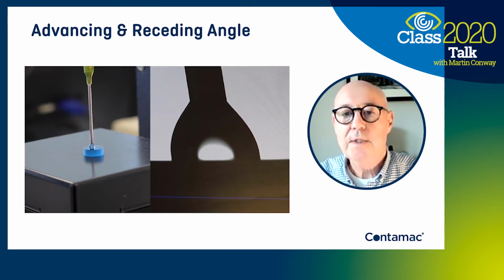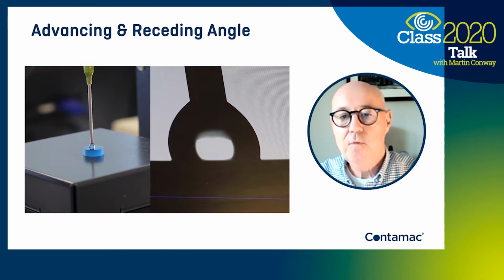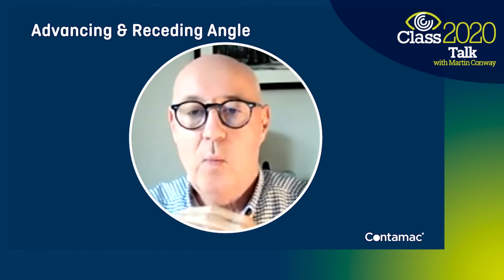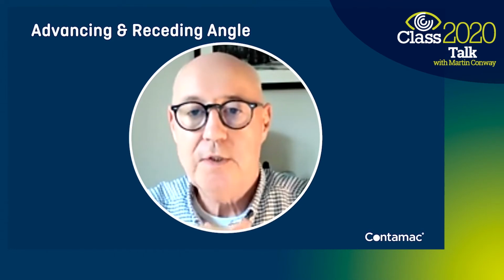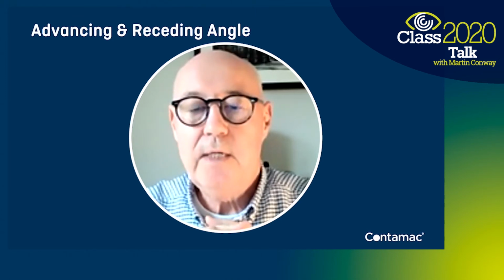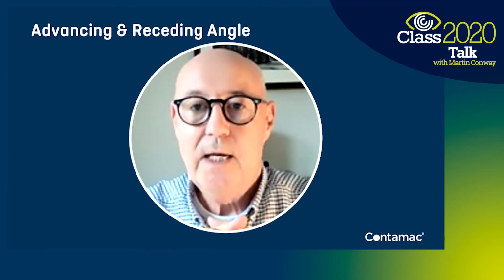We can see the droplet growing and then being withdrawn, and expanded. And you can see that the wetting angle, the contact angle between the droplet and the surface, changes with each of those movements. So as I said before, the advancing angle will indicate how readily the surface will wet as the lid passes across it. The receding angle is important also because it really gives us an indication of how stable that tear film is going to be after the blink.